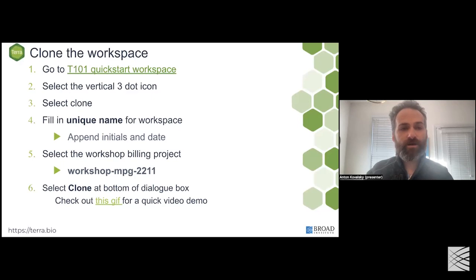So what we're going to start in a few moments is cloning the workspace. If you cloned this workspace at the last session, you can go ahead and use the same clone. You don't need to create a fresh one for this demonstration. As soon as we do that, we'll also launch our notebook. Then I'm going to just talk through the platform a little bit while the notebook starts up, because that process takes between 3 to 5 minutes. So we don't want to waste that downtime. We'll go to the clicking, and then I'll come back and explain why we did the clicking.